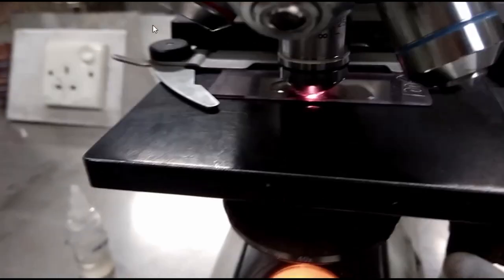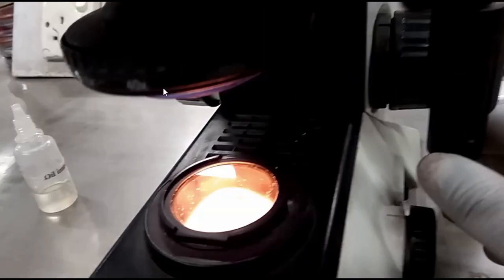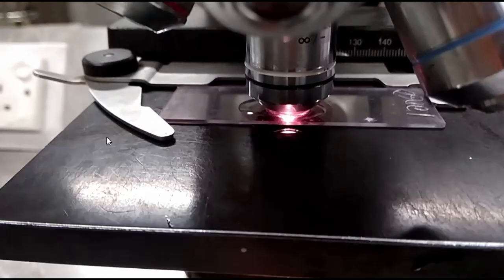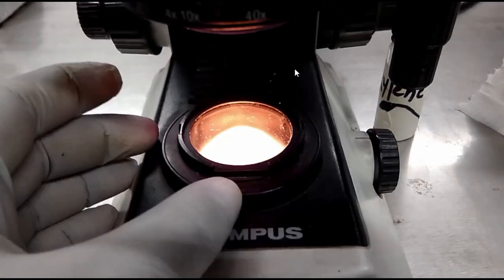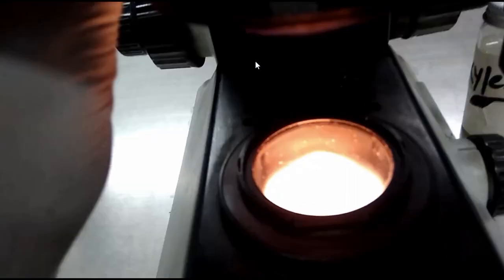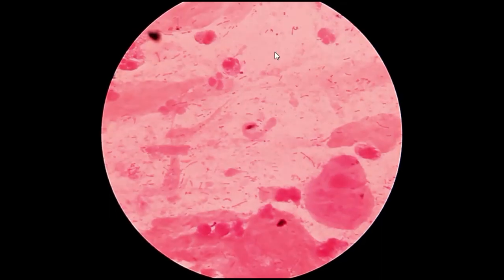In this condition, you can adjust the aperture at 100x and the fine adjustment. Yes, this one is the fine adjustment for clarity of the image, and moving the aperture, and we also have to move the condenser in this way. Here you can see.